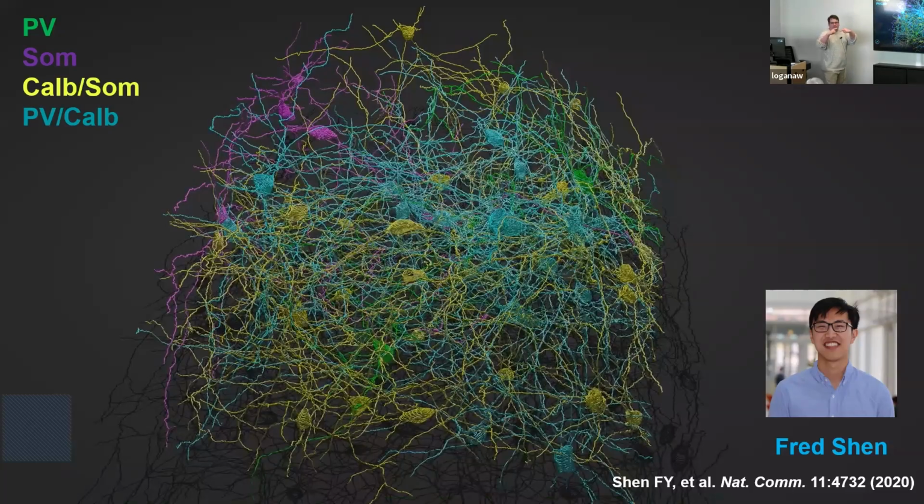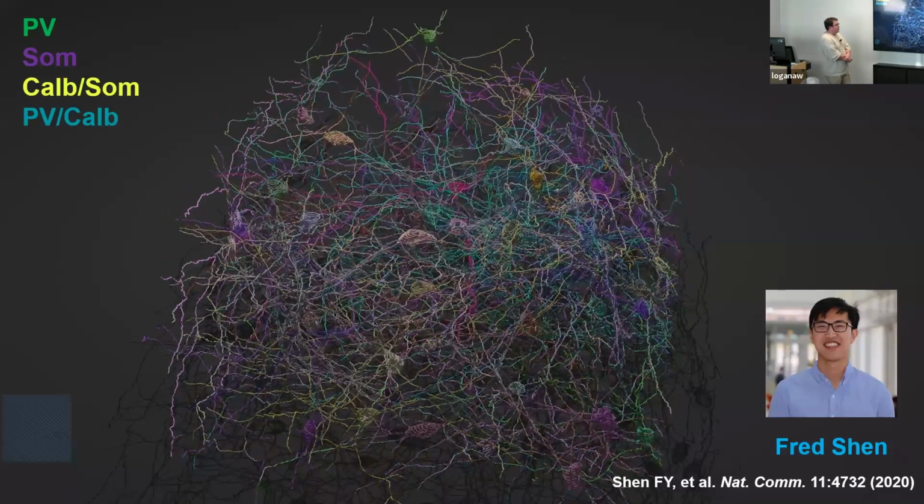So all of the stitching approaches are basically you shift everything around until mathematically these two things line up, and then you say that's correct. But that is a really hard optimization problem, especially when samples get bent in weird ways and stuff like that. So dealing with that is quite a challenge, actually.